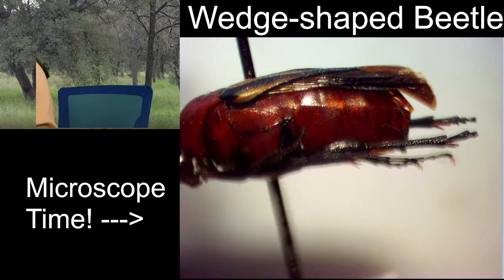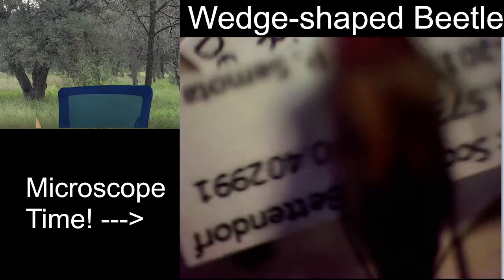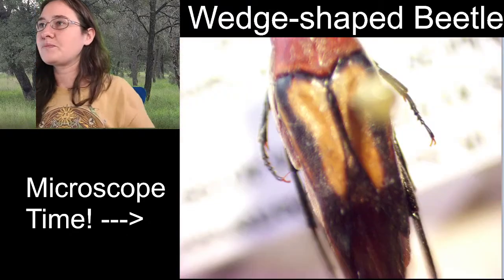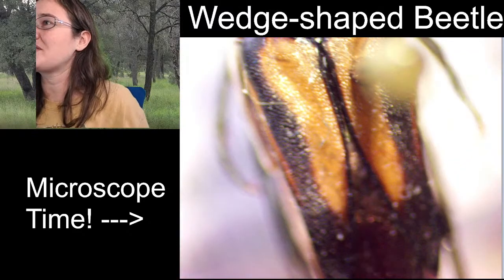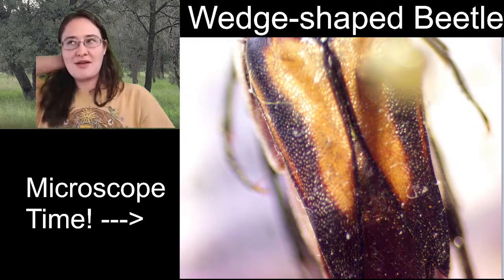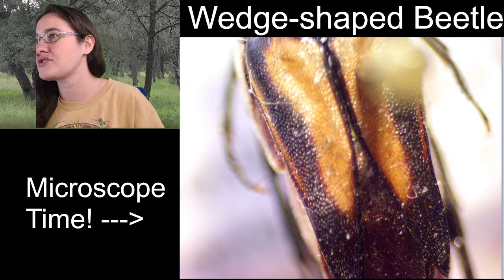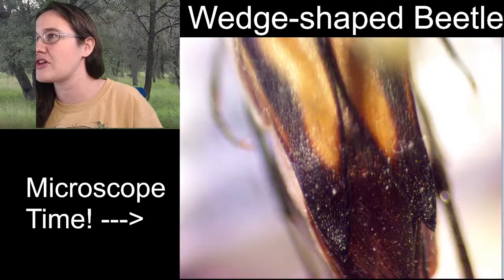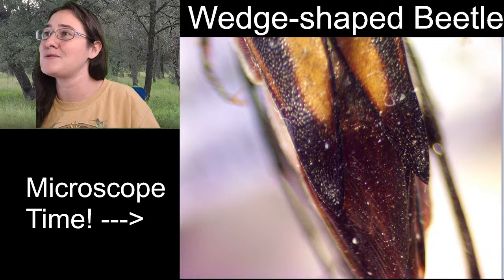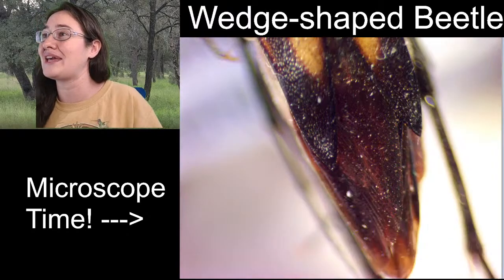All right, let's go ahead and look at it from above, because I think that we mostly just looked at it from above in the beginning. And I want to share with you how pretty the elytra are. So this is what the elytra look like from the top. They have that dark band all the way around the edges, but they're mostly gold in the center. And then when we scooch our specimen back just a little bit, we can see that you're not looking at the top of the abdomen, even from this point of view. You're actually looking at the wings, right?